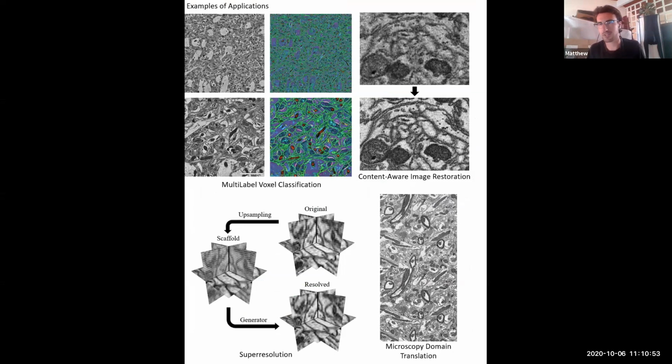But one of the things I'm trying to sell here is that it's not just that I created an AI that I normally wouldn't have, or that wouldn't have scaled. It's that I'm able to, on my feet, just create a bunch of them that have different functionalities. So this one in the upper left is a multi-label voxel classifier. This one I train off of ground truth data that I annotate to label all of the structures in these microscopy volumes. So in these color overlays, there are labels. These pink ones are synapses. These teal ones are neurotransmitter. The green is the boundaries of the neurons. And so that's a scalable microscopy application that I wouldn't have considered building in the first place if I didn't have this kind of data processing scheme that I could wrap efficiently.